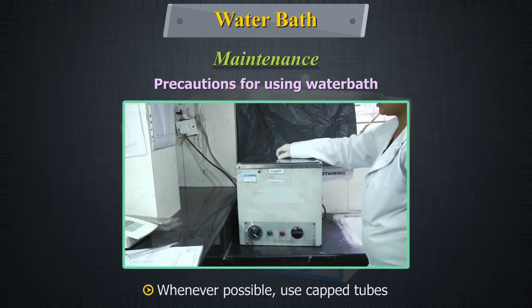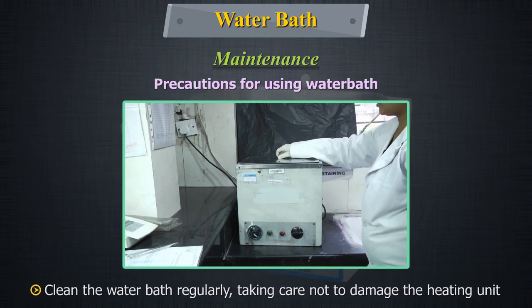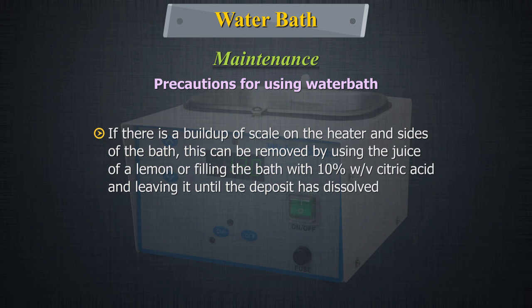Wherever possible, use capped tubes. Clean the water bath regularly, taking care not to damage the heating unit. If there is a build-up of scale on the heater and sides of the bath, this can be removed by using juice of a lemon or filling the bath with 10% citric acid and leaving it till the deposit has dissolved.